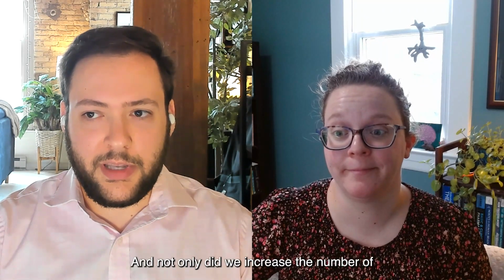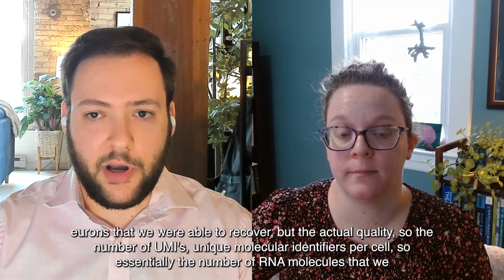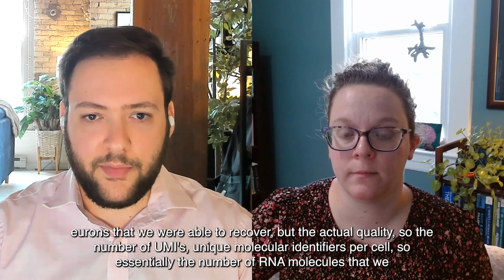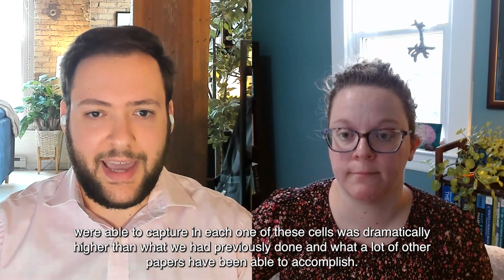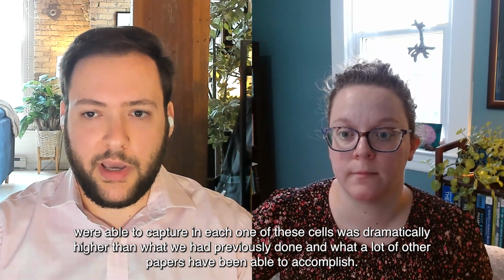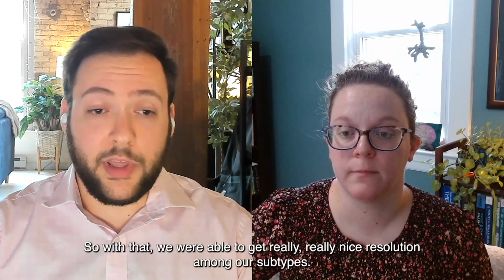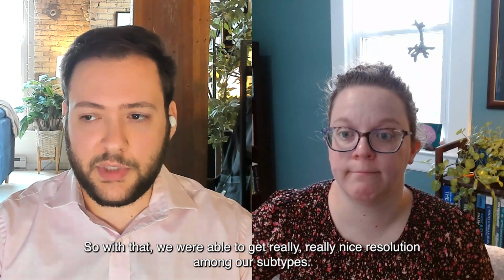And not only did we increase the number of neurons that we were able to recover, but the actual quality. So the number of UMIs, unique molecular identifiers per cell. So essentially the number of RNA molecules that we were able to capture in each one of these cells was dramatically higher than what we had previously done and what a lot of other papers have been able to accomplish. So with that, we were able to get really, really nice resolution among our subtypes.